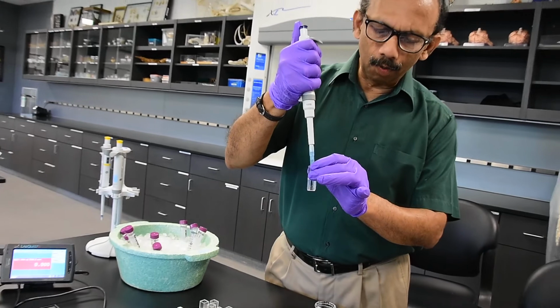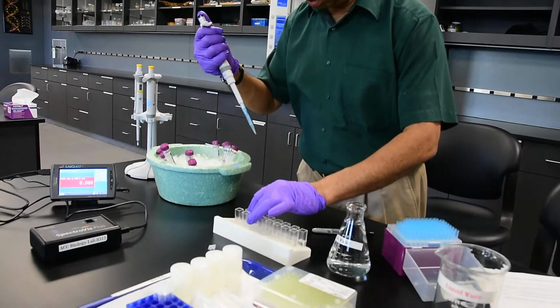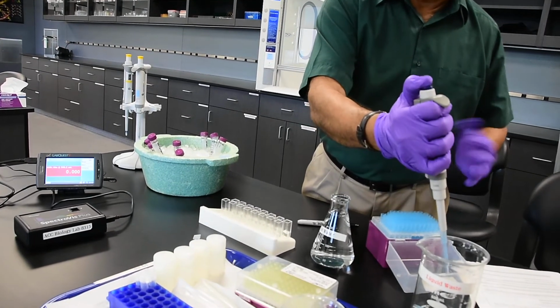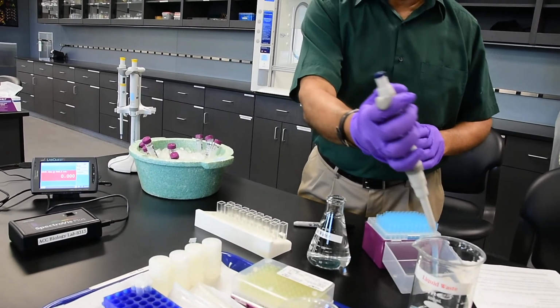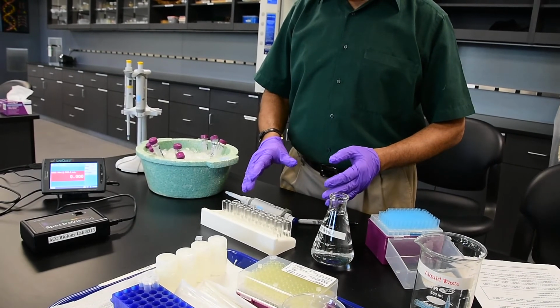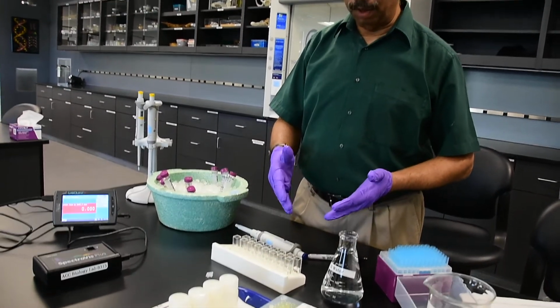At the end, you want to take that and discard that last one into a liquid waste, and we can discard all these things later on, and also the tips. Okay? So now we have all these concentrations done. Then only I'm going to add the enzyme to do the reaction.